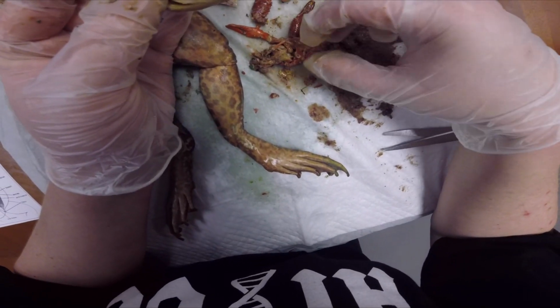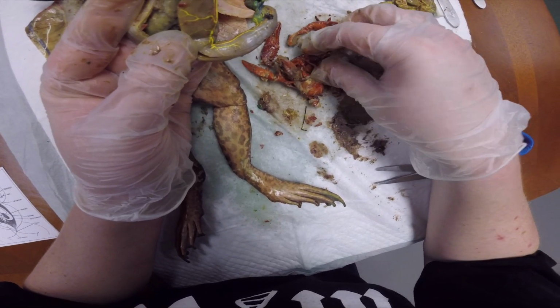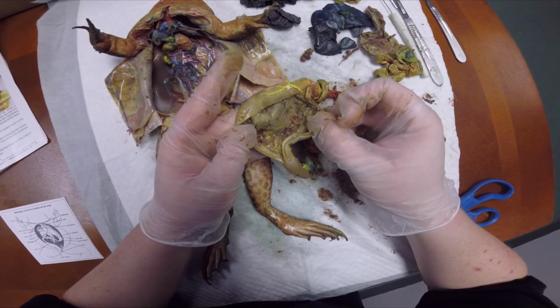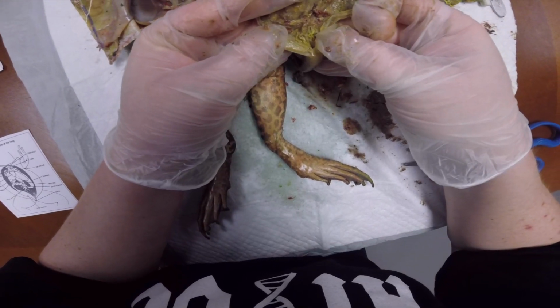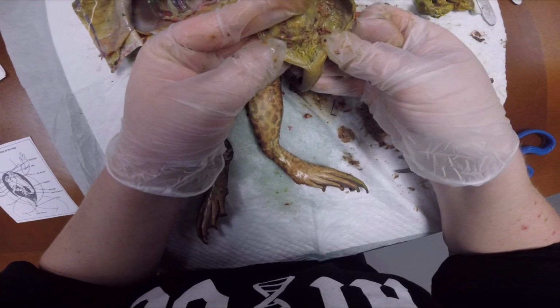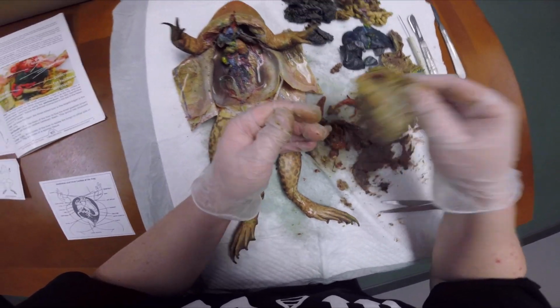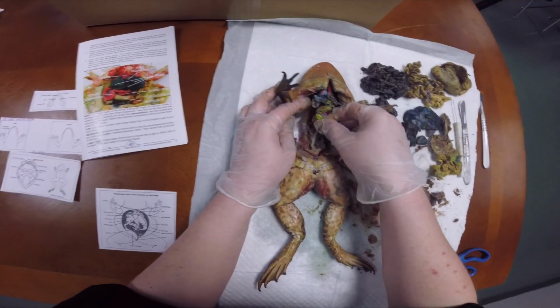Check it out. So that is a partially digested deliciousness. Alright, so in here you can kind of see those folds like we looked at. It's a good stomach. Okay, so there's that. Alright, let's see what else we can identify in here.